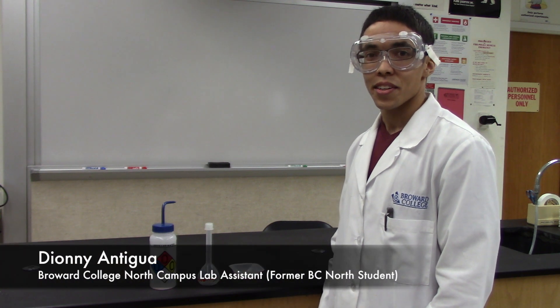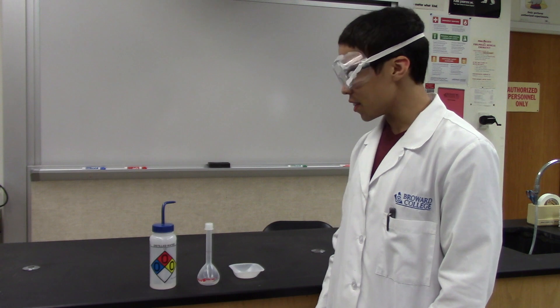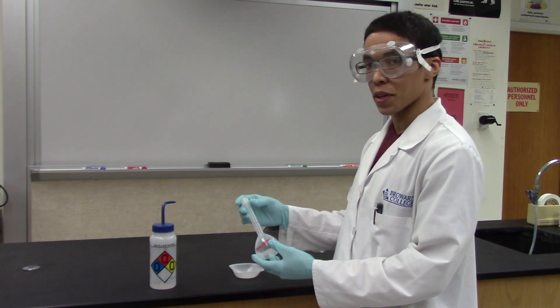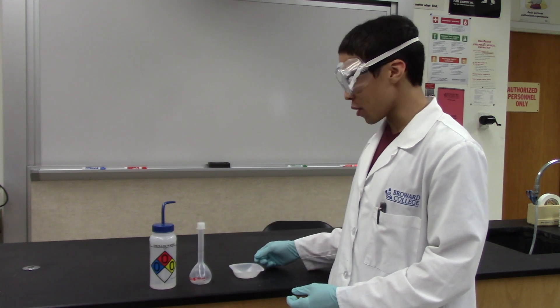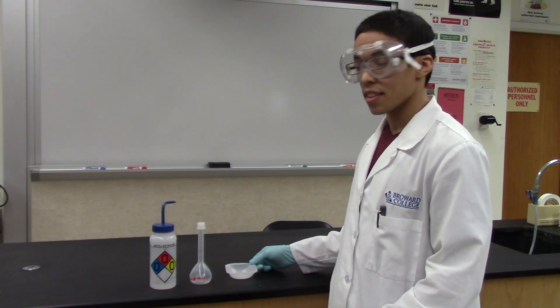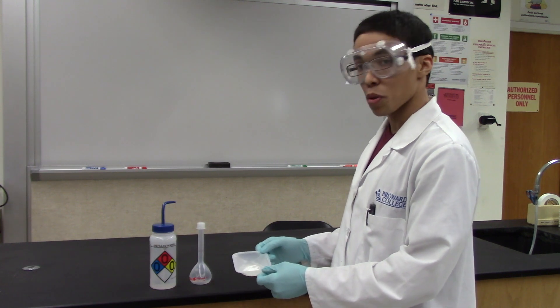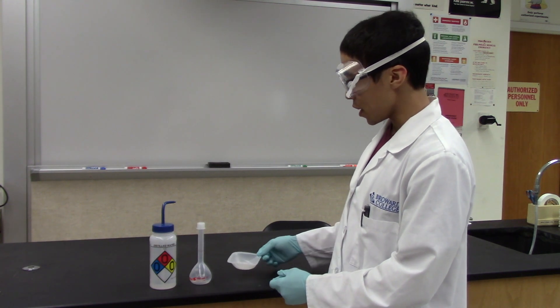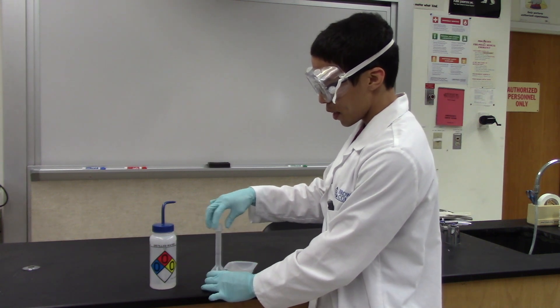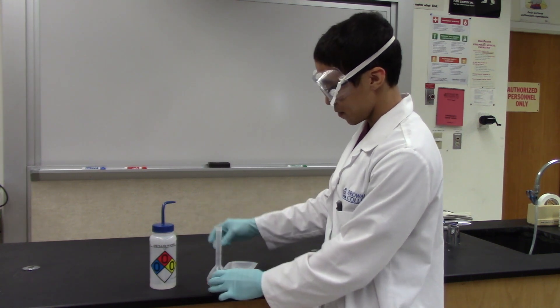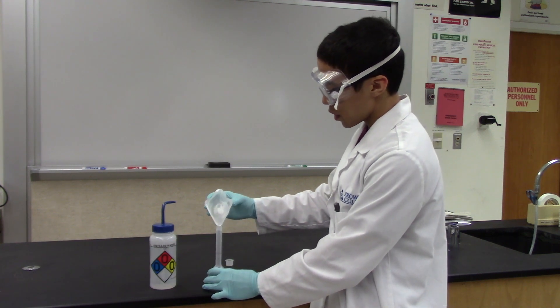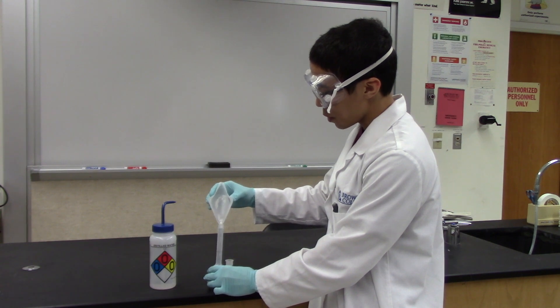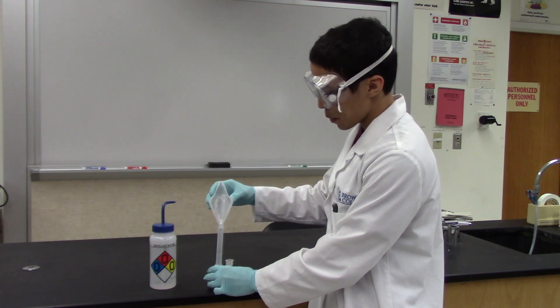Hi, my name is Dylan Antigua. I'm a laboratory technician here at Broward College North Campus. In this experiment, you'll be using a plastic 100 mL volumetric flask. You'll be weighing out one gram of antacid tablet into a weighing boat. You will then take that one gram and transfer it to the plastic volumetric flask. You will bend the weigh boat, try to get every bit of it into the volumetric flask without spilling as best as you can.